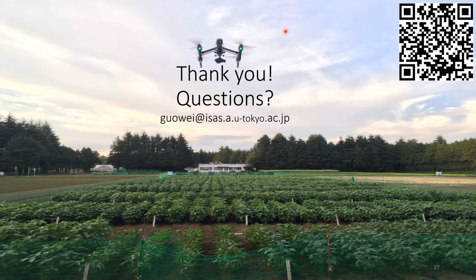Oh, okay. So actually, this is a very difficult question to answer, because there are a lot of libraries that can help you do feature extraction. Basically, if you are new to image processing, I would recommend MATLAB with the Image Processing Toolbox, and you will find a lot of useful functions to do this kind of feature extraction.